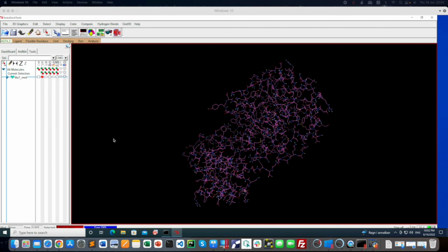So basically the hydrogens which are bonded to the carbons are merged, and only the partial charge of each non-polar hydrogen is added to the charge of its carbon, and then the hydrogen is eliminated from the molecule. So this is why you use merge non-polar hydrogens, which is very beneficial, and I think the resource use and the computational time will be reduced by using this particular option.